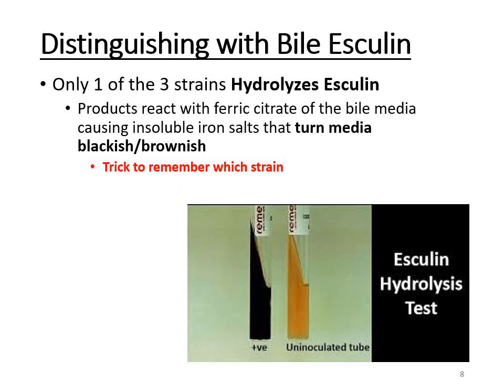that is E. faecalis, okay? So make sure you're very comfortable with knowing the different tests that you can use to quickly identify a particular strain out of the 3 species that we're talking about. So for instance, Bacitracin showed us pyogenes. Bile Esculin quickly shows us E. faecalis, and then the one that's left over out of that, you know is Agalactiae.